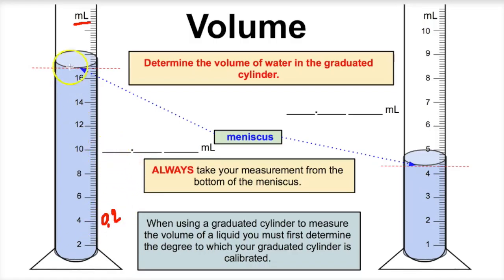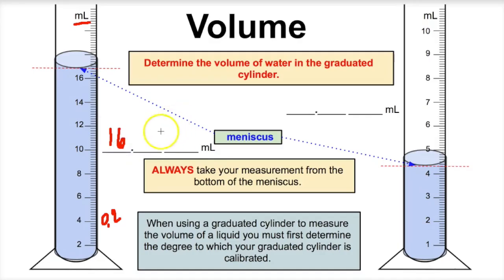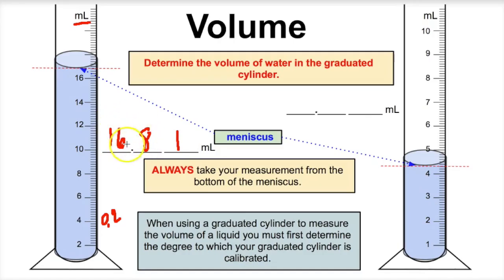If we want to determine what the volume of the water is inside here, we have to get really close and take a careful look. We can see that this is 16.2, 16.4, 16.6, and it looks like 16.8. So we know the water inside this graduated cylinder is 16.8 milliliters. And if we zoom in even closer, we can see that the red dashed line is just a little bit past that mark, so we'll call this 16.81 milliliters. The hundredths place is a little bit uncertain; we had to estimate that. However, the 16 and the 8 are measured with 100% accuracy.